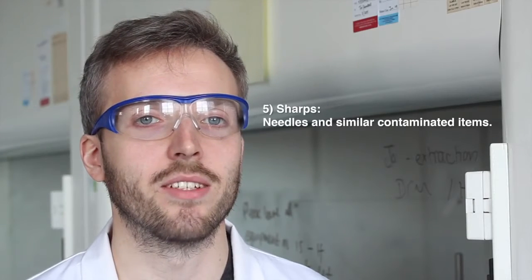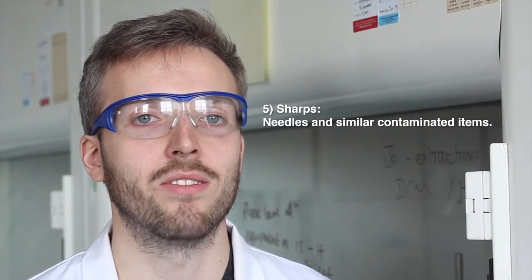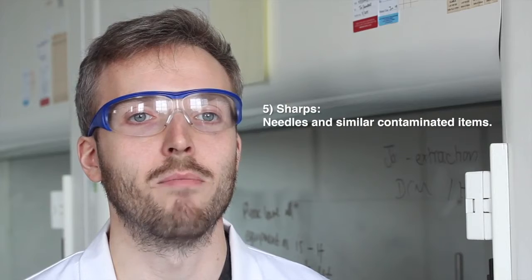Fourth, broken glassware, which basically includes any type of glassware. And fifth and last, we have sharps. Sharps are extremely dangerous because they can be very small and hard to notice and consequently severely harm other group members or cleaning personnel. These must be thrown in sharps containers. If you are disposing of a needle, you need to put back the needle guard.